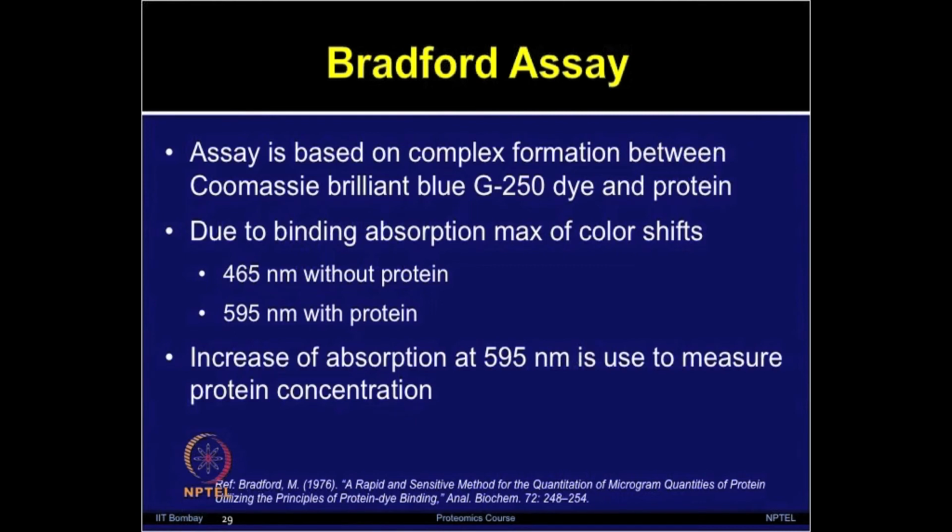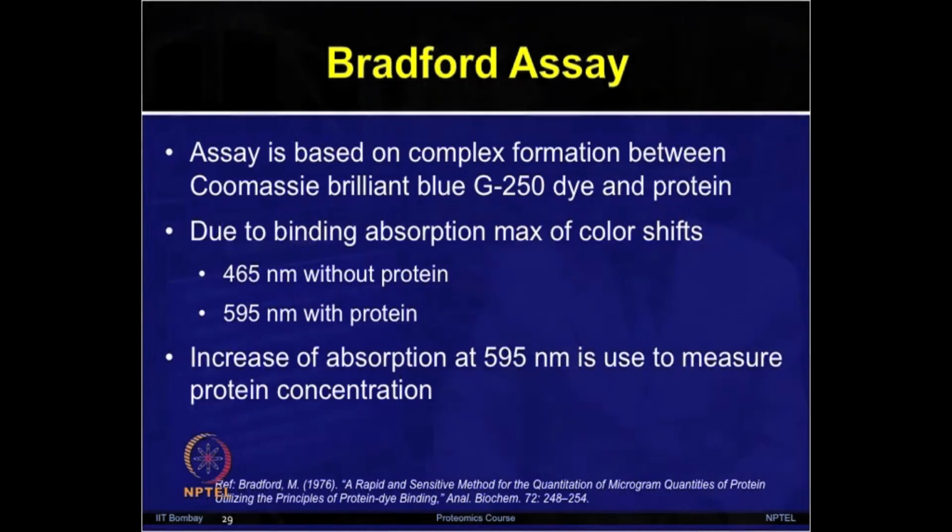Due to the binding, the absorption maximum shifts from 465 nanometers to 595 nanometers. This increase of absorption at 595 nanometers is used to measure the protein concentration.